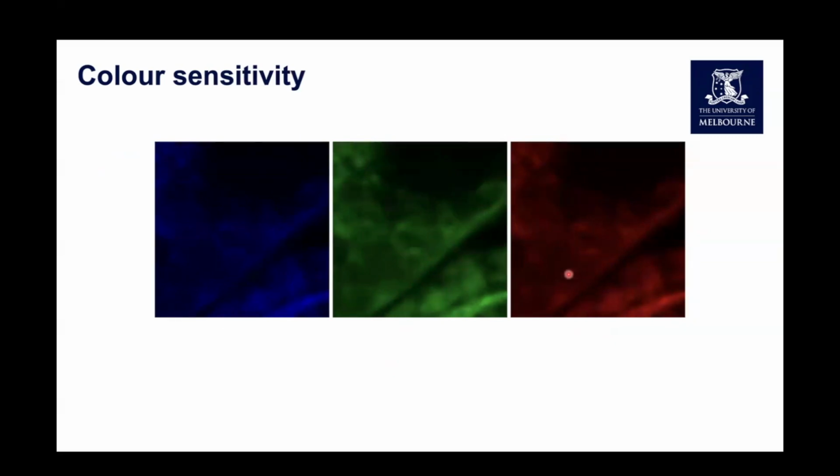And that goes to how our eyes interpret color. So we see very well in the green and red wavelengths, not so well in the blue wavelengths. So this is a very simple representation showing you, depending on what color you've assigned to each of your channels, that can affect the interpretation of the data from those channels.